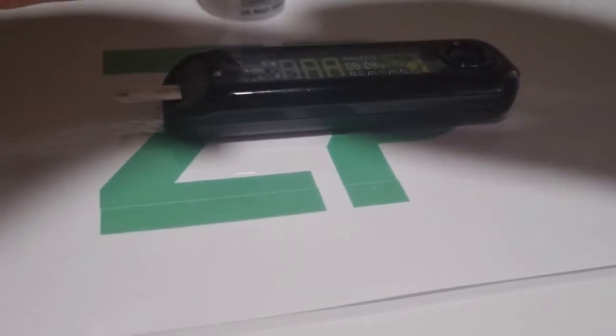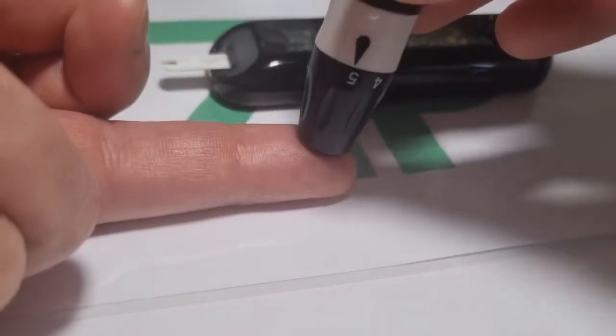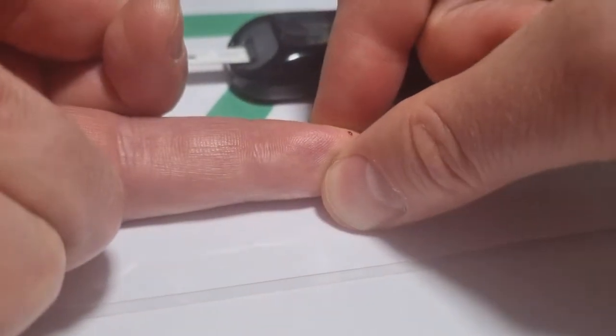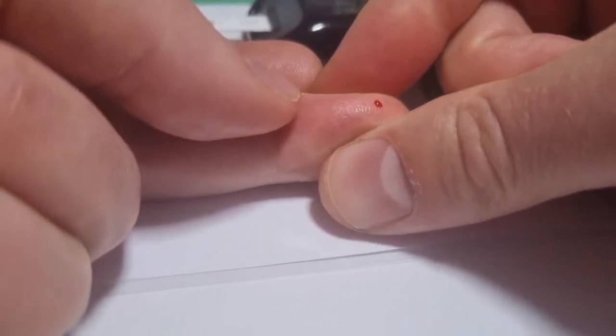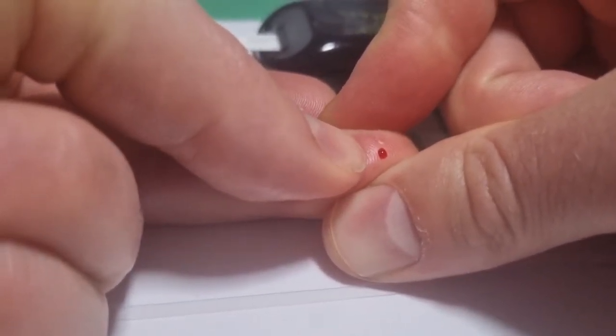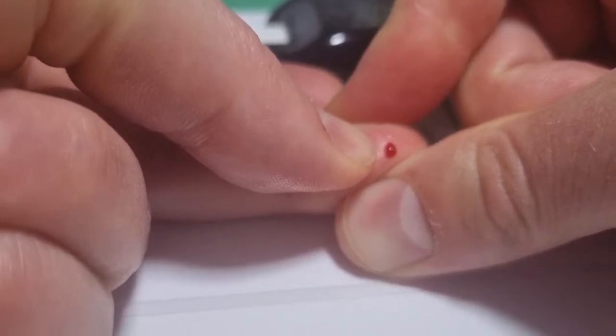Now what I'm going to do is gather the sample, and the sample is easy enough to gather. So you do that, and I might have to do that a bit more — try and get some blood. Hopefully that's enough blood now.